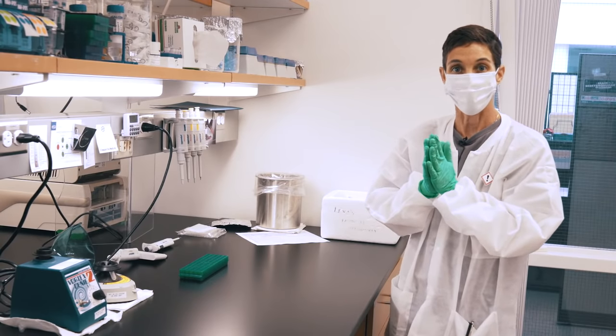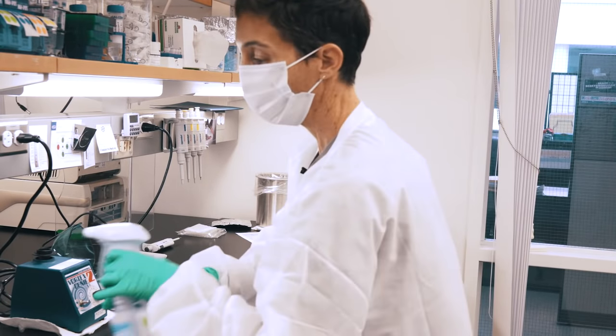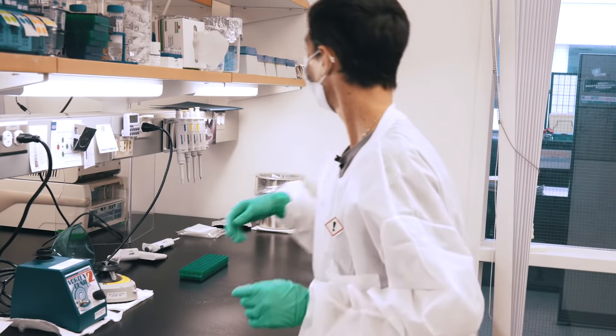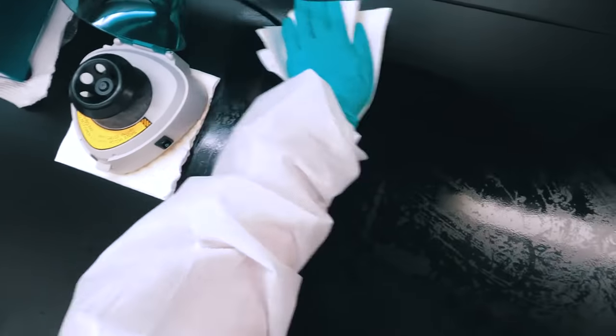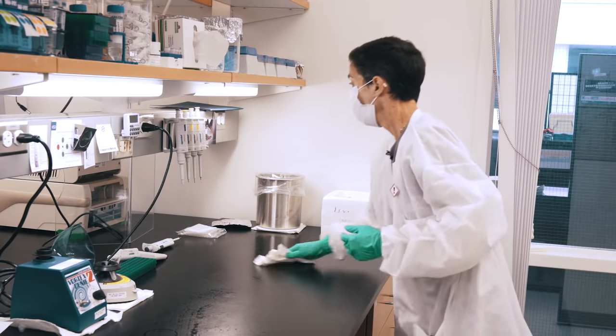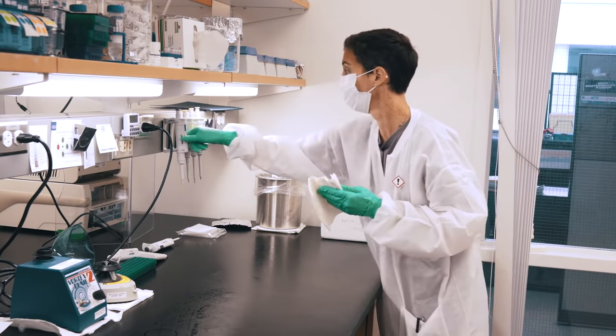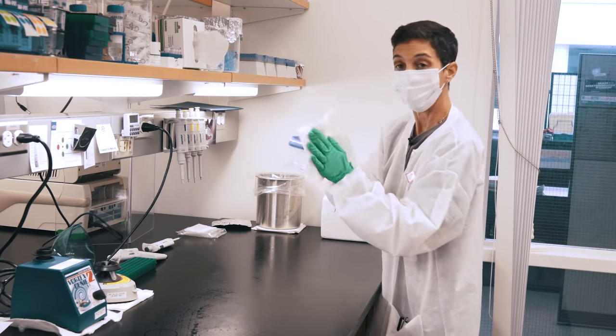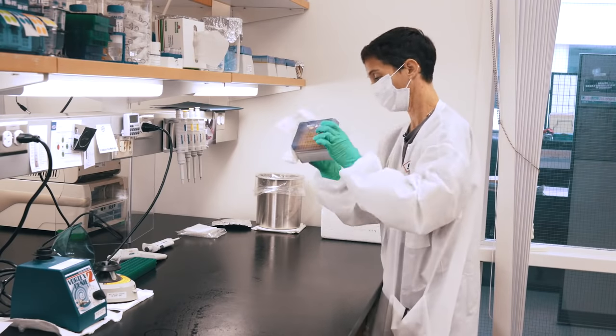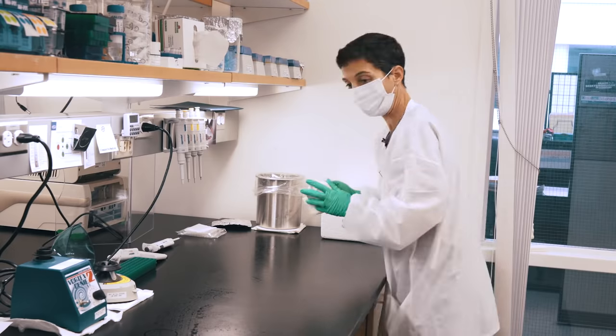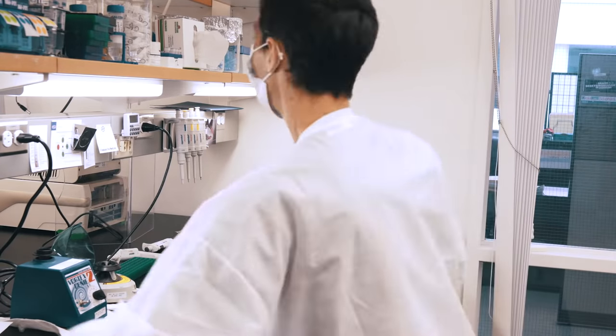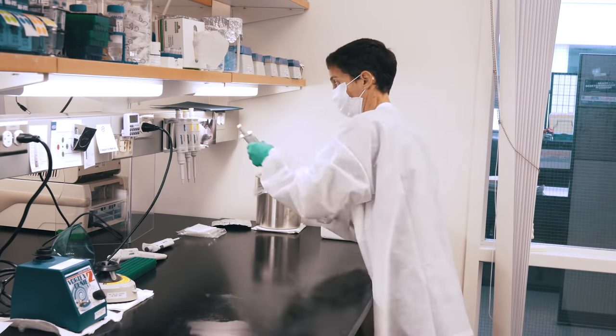Okay, so this is the part where we set up our reactions. The first thing to do is to glove up and then to wipe down your work area. You're going to use bleach, a 10% mixture that is made fresh at least weekly. By the end of a week, the bleach will have degraded. So I tend to make it up every Monday morning. You want to wipe down your pipettes, particularly the barrels, and your tip boxes. After you've used the 10% bleach, you need to do a wipe down with 70% ethanol to remove the bleach from your surfaces.